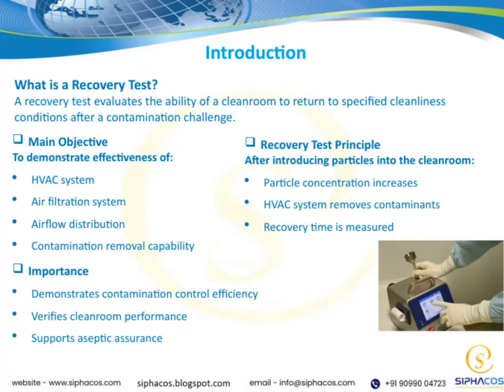Let's talk about the recovery test principle. After we introduce particles into the clean room, the particle concentration rises. Then, the HVAC system kicks in, removing those contaminants. We measure the time it takes for the cleanroom to recover, to get back to its specified cleanliness level. This test shows us how well the HVAC, filtration, and airflow systems work together to clear contamination. It's a key way to prove the cleanroom's performance and support aseptic assurance.